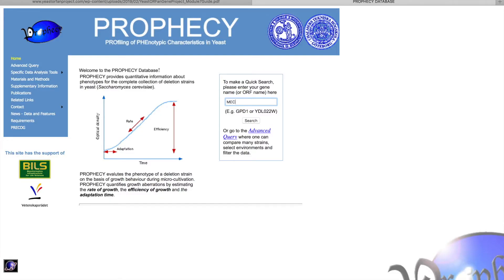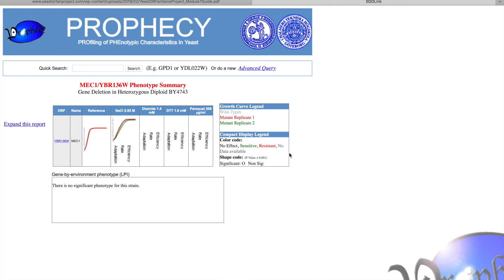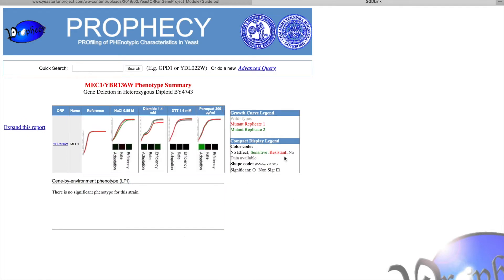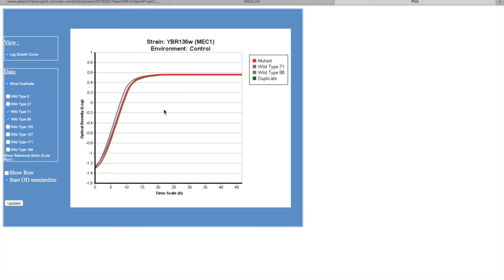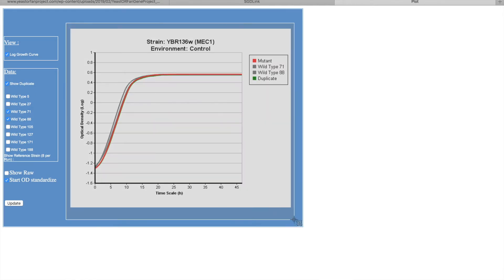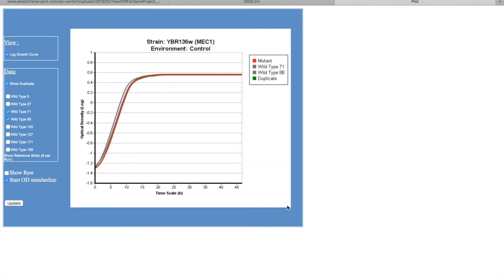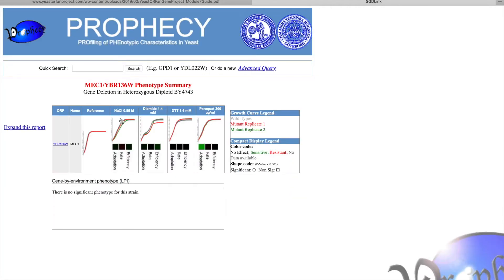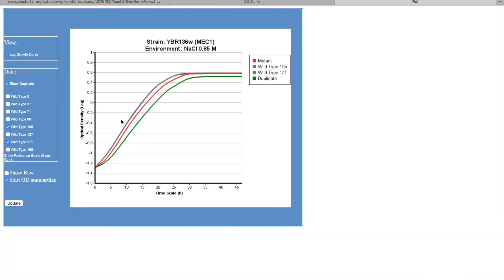I will be using MEC1 and it's going to open up to this page and it has four different charts. One that is a control and that's showing on growth medium a mutant and a duplicate versus two wild types.